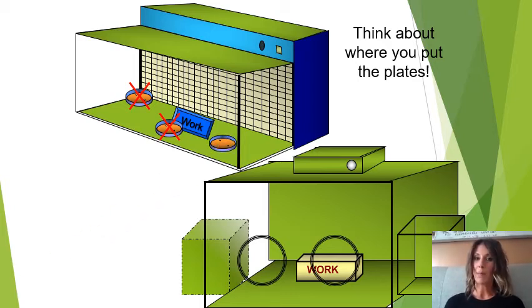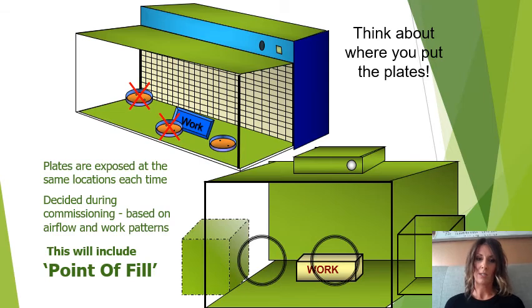It's more central to the laminar flow cabinet, so it's not right near the back where the cleanest part is. It's not in obstruction to your work process, but it's alongside it. It's not impaired by any obstructions. So that's a better representative.